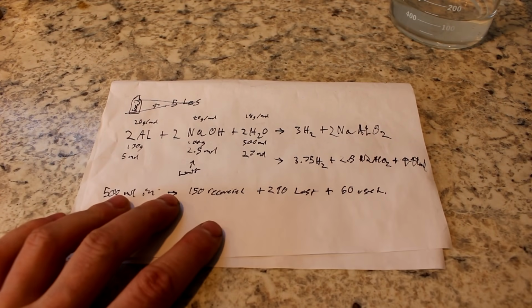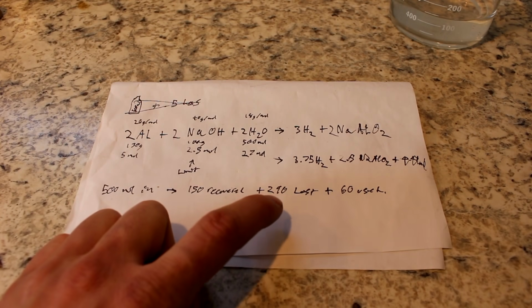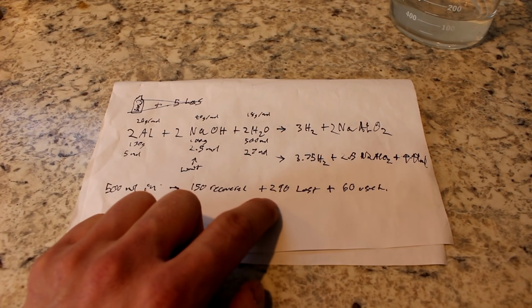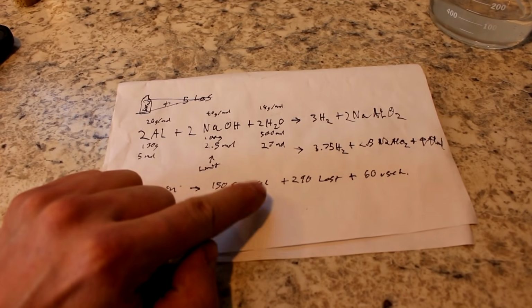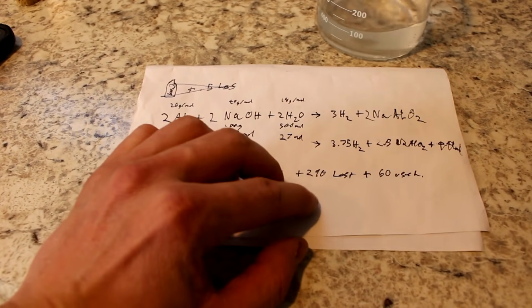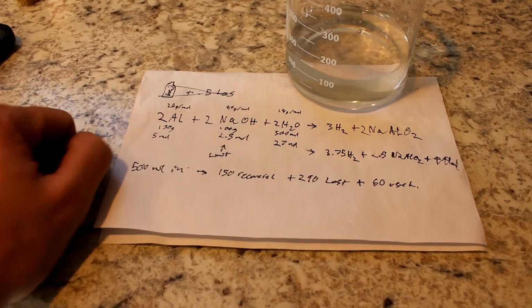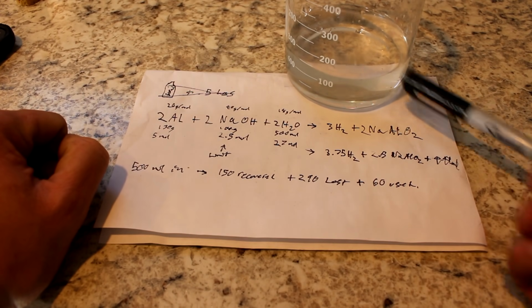I thought I was being really careful with it, you know, trying to recover it using the copper tube and sealing the vessel and everything, but that quantity of loss does seem to make sense because this isn't very sophisticated apparatus. I mean, look at it, it's a tea kettle and a fish tank. Perhaps if I do this again it'll be a little bit better, but yeah. But I should still have increased the deuterium content on this. At least a little bit. Not as much as I was hoping for, but it should be at least concentrated a little. And I will take a sample of this and hopefully I can get that analyzed as well.